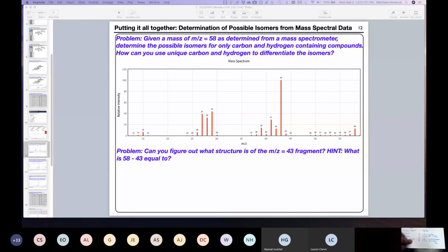So what I'd like to point out to you, conceptually, is what proton NMR is. These ratios, see how 2 and 2, 2 and 2 are the same? These ratios are what we will use to differentiate these isomers experimentally.